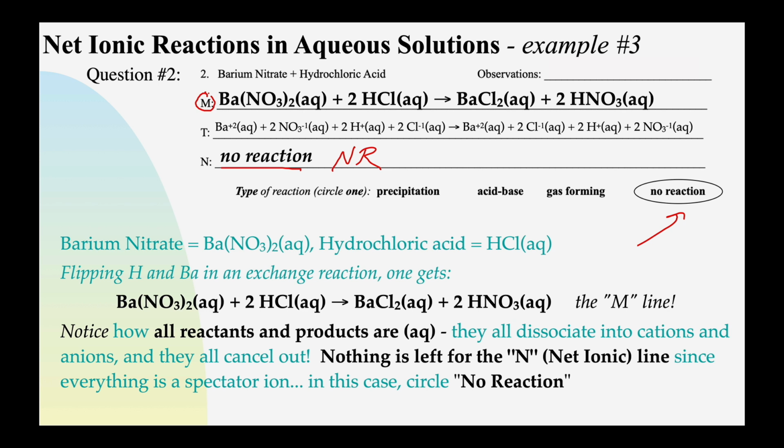All right, all these ions are just sitting around looking at each other, and that's cool, but it's not very exciting from a chemical perspective. So you would literally see nothing on this particular reaction. It would look like a watery substance and a second watery substance are mixed together, and you just get more watery substance. Not the most exciting part. A lot of chemistry actually is not very exciting because sometimes there's just no driving force, no reason for chemicals to combine. And this is an example of one of those kinds of reactions.